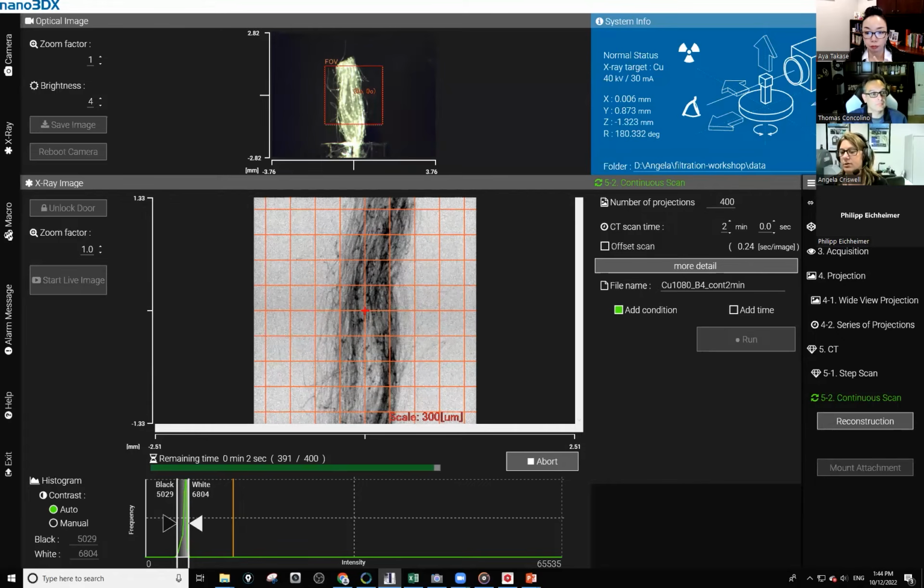So in general, when using this instrument, your data collection in unbinned mode is going to be anywhere from 2 hours to 20 hours. Usually I end up in the range of 4 to 8 for good contrast for small samples that are lightweight materials.